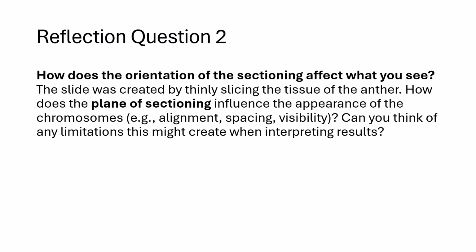Consider how a 3-dimensional process is being viewed in a 2-dimensional slice. Some structures may be partially cut, hidden, or distorted. Pause and explain how this affects what conclusions you can confidently draw.